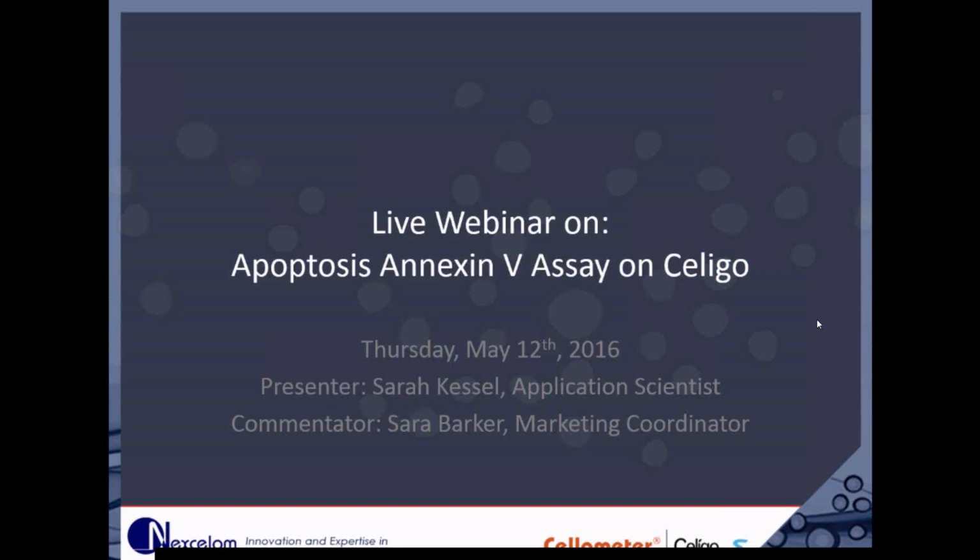Great. The next question is, is the analysis of green and red stain limited to within the blue overlay that is first defined? So yes. The idea of the mask, which is identifying the blue nuclei, is to identify all of the cells.